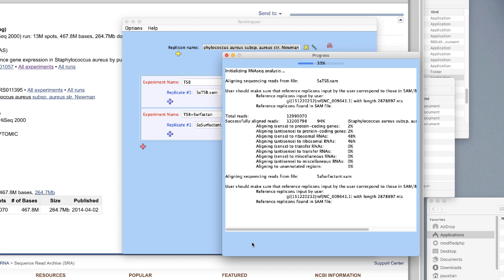It is done with the first read and you'll see it successfully aligned is 94%. About 90-some percent was to ribosomal RNAs, but that's totally expected because most of what the cells make is ribosomal RNA. It's really the 2% that isn't ribosomal RNA that we're interested in. Now it's doing the surfactant one — depending on the speed of your computer this can take a while, so you need to be patient.